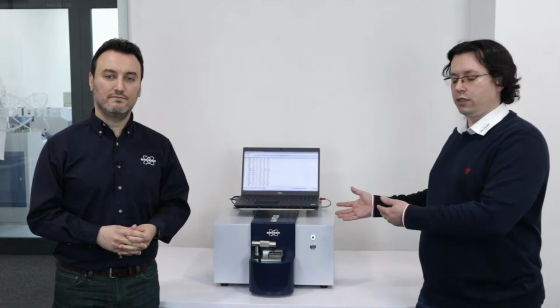No, not really. I mean, in one single instrument, we can have up to 10 different matrices, like the ones we talked about: aluminum, titanium, cobalt, nickel, zinc, tin, lead. So we can have all these 10 different matrices in one single instrument. So analytically speaking, these CCD systems are so flexible. Yeah. And again, it is mainly used for quality control and also process control. And when we talk about process control, we are talking about traces. And for that, we use mainly our Q8 Magellan that we have here.